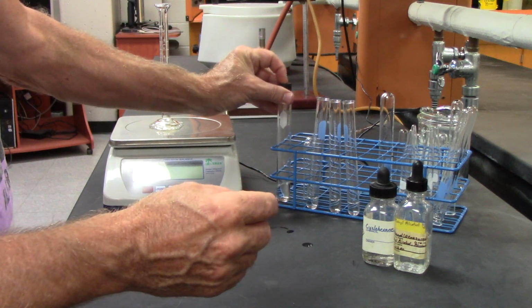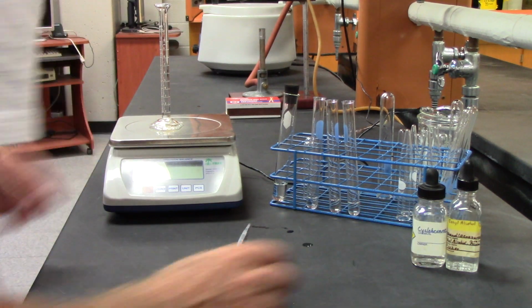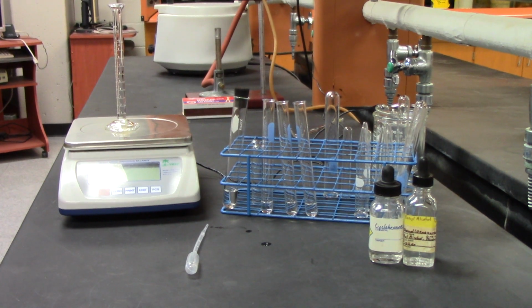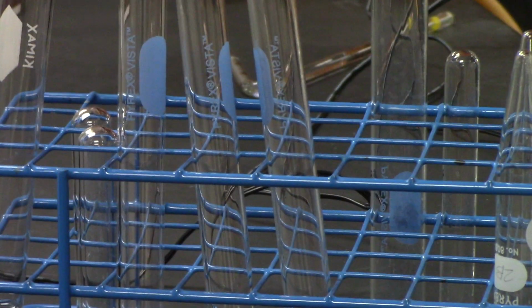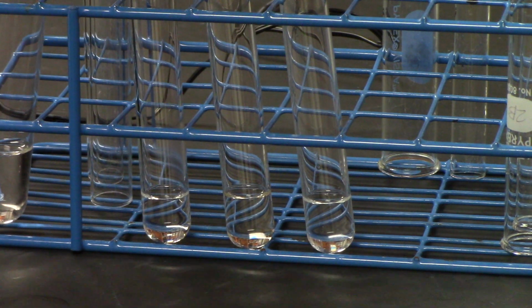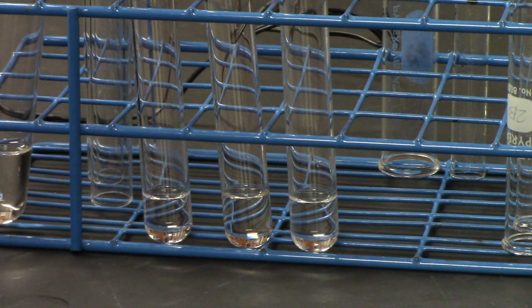Now I keep the cap on because it's possible that this might be evaporating, so I want to make sure it doesn't evaporate. So I have my known samples and three samples. And what I'm going to do is in the first one, I'm going to put water. And then next one, I'm going to put cyclohexane. And the third one, I'm going to put ethyl alcohol.